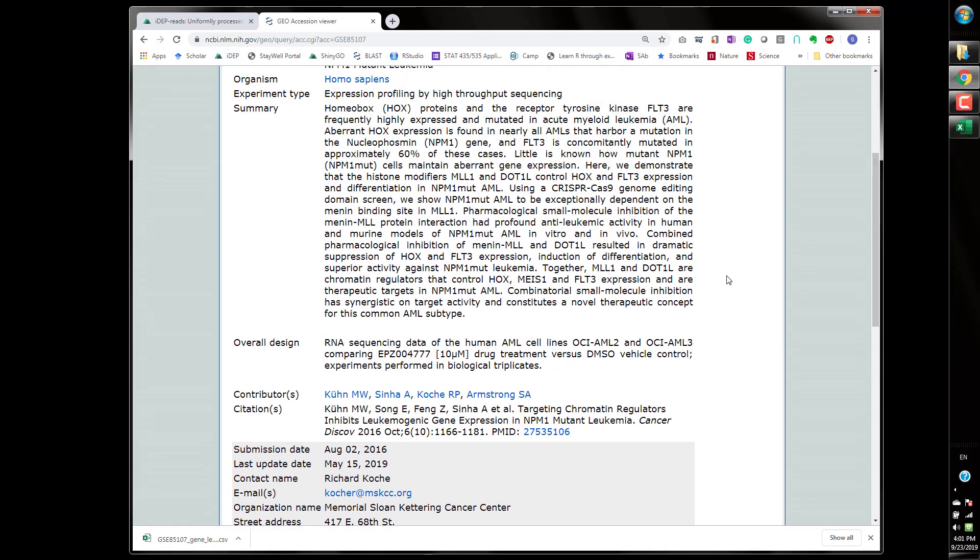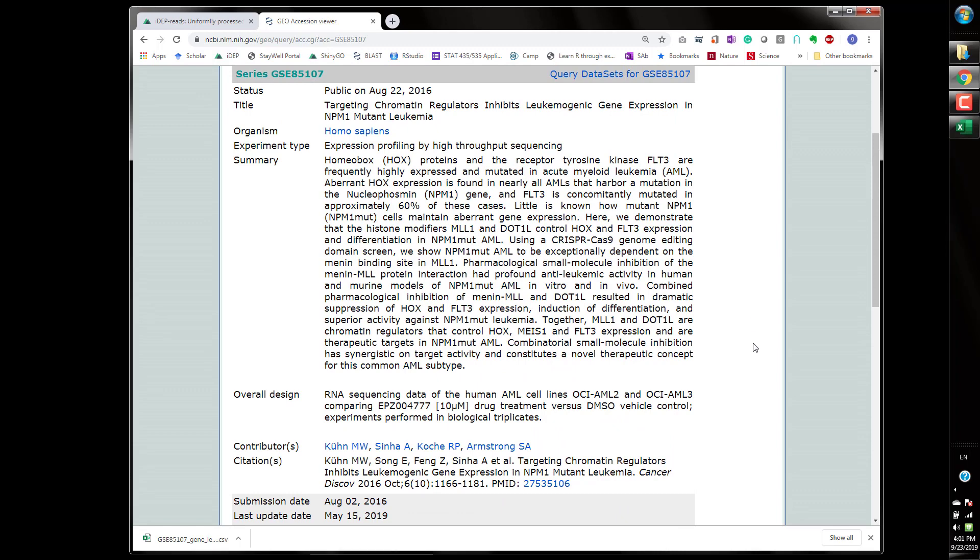They have a paper published so this is two cell lines. What they're looking at is a pharmaceutical compound that inhibits the MLL1 and DOT1L so those are chromatin remodelers, chromatin regulators.